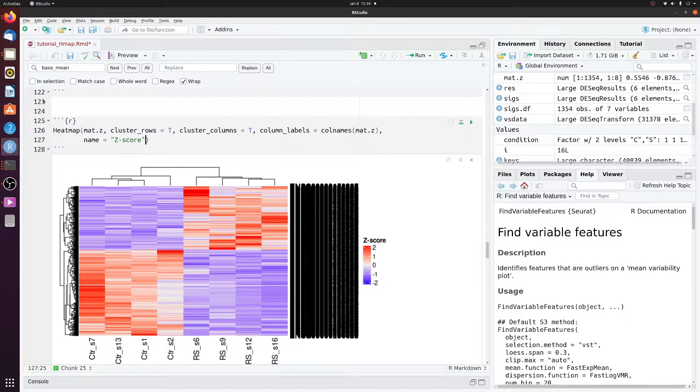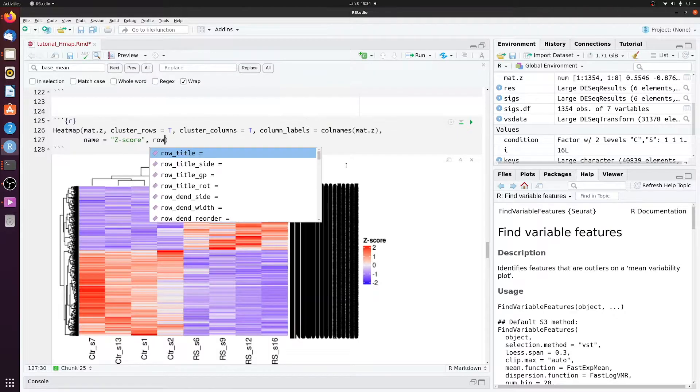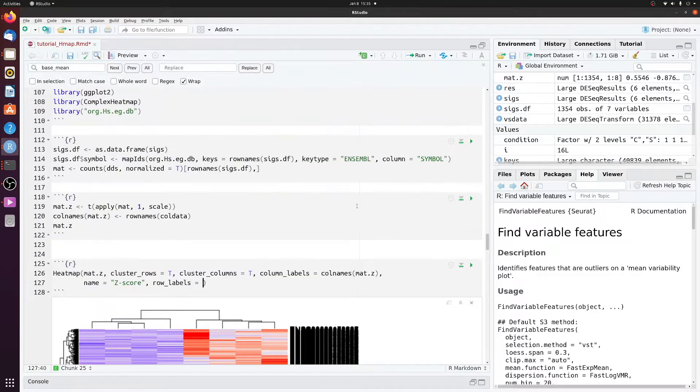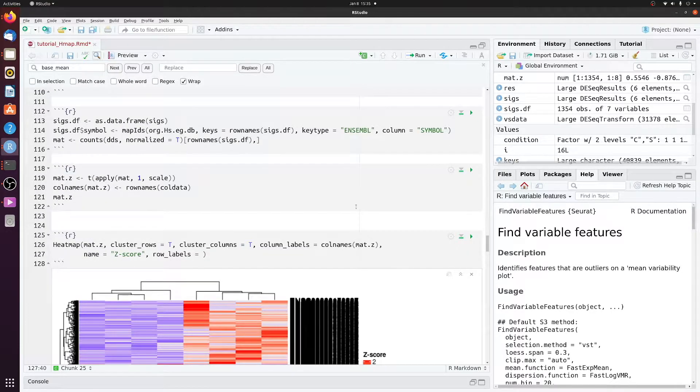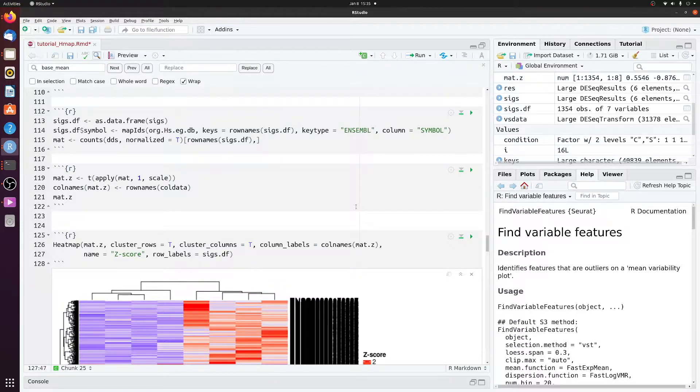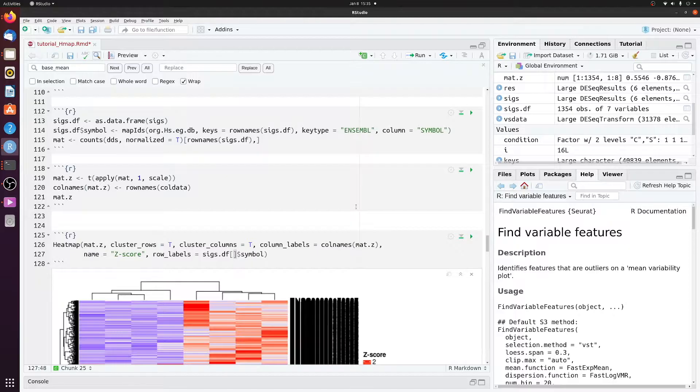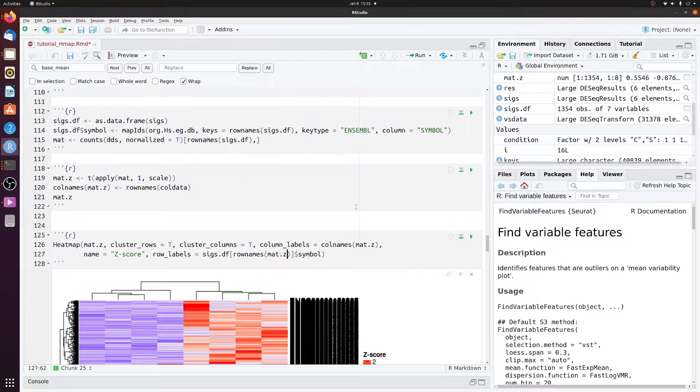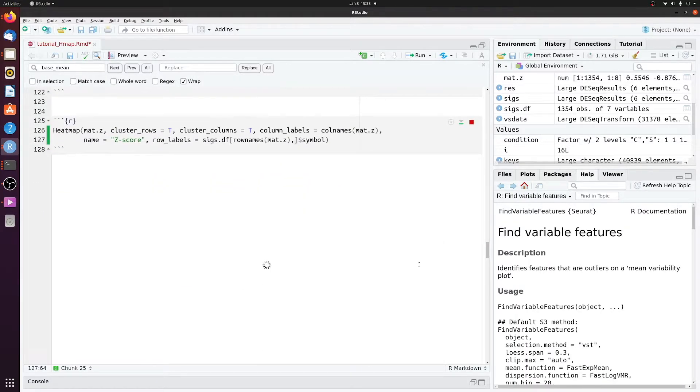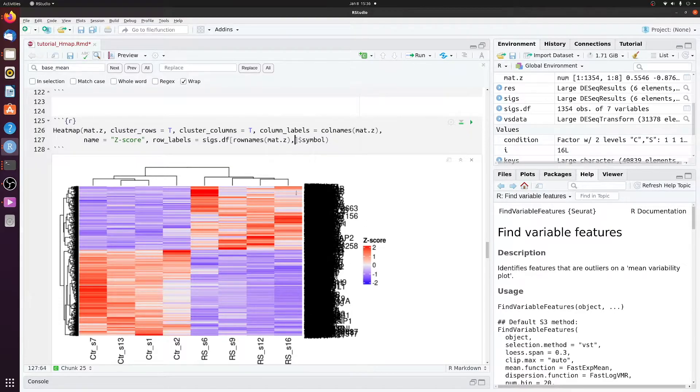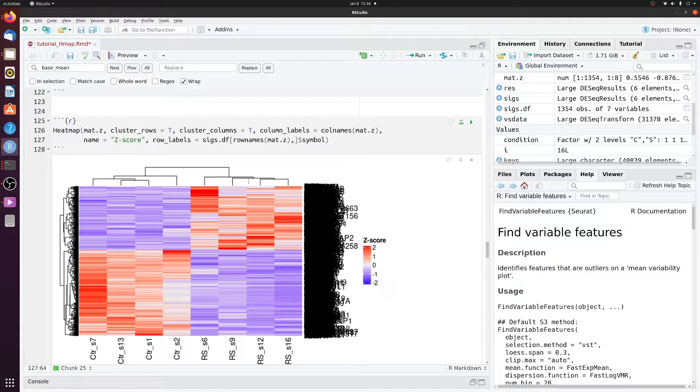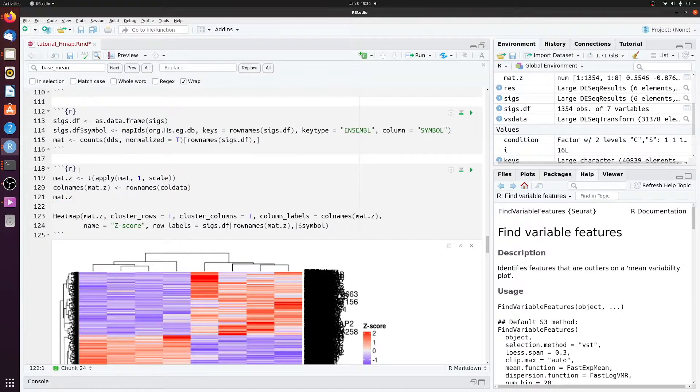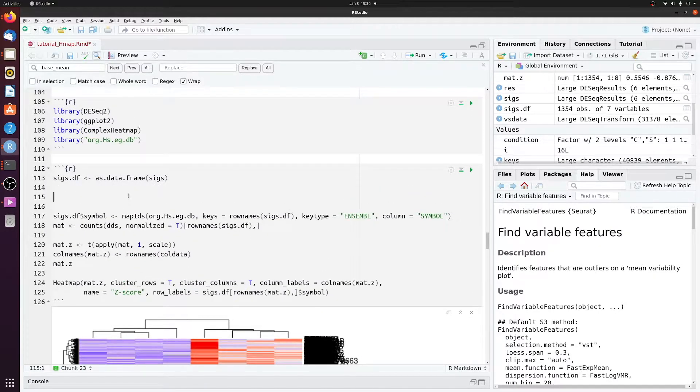Actually, one thing, I didn't use the symbols that we mapped to. So row labels is going to equal the symbol column of sigsdf. But only where sigsdf equals the row names of mat.z. So only where the ensemble IDs overlap. So now we have the symbols, but of course we can't actually read anything because we have 1,300 rows. So let's just combine this.